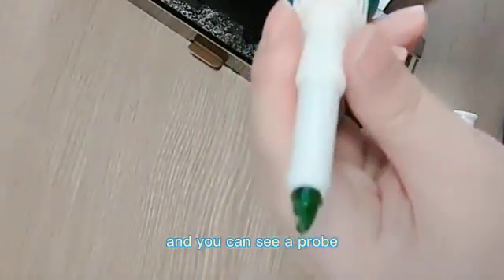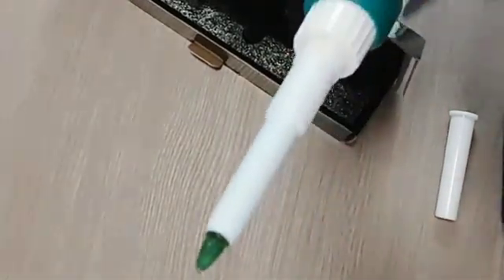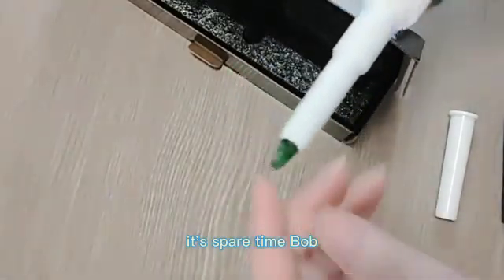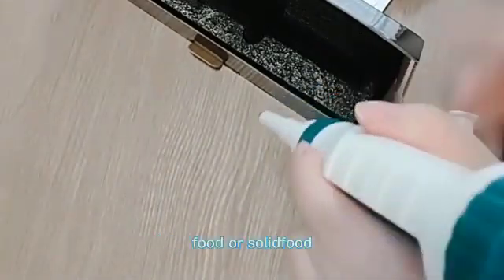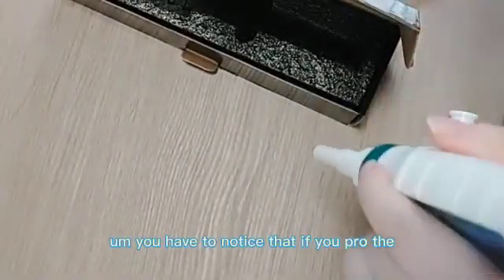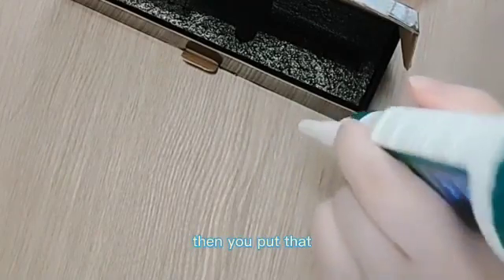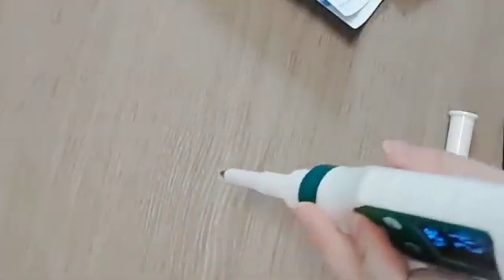You can see our probe — it has a stopper and it has the electrolyte solution in it. It's a spear-type glass probe, specially designed for sticking into semi-solid or solid food. You have to notice that if you test a very solid food, you can use a knife to make a hole first, then insert the probe so it won't damage the fruit.